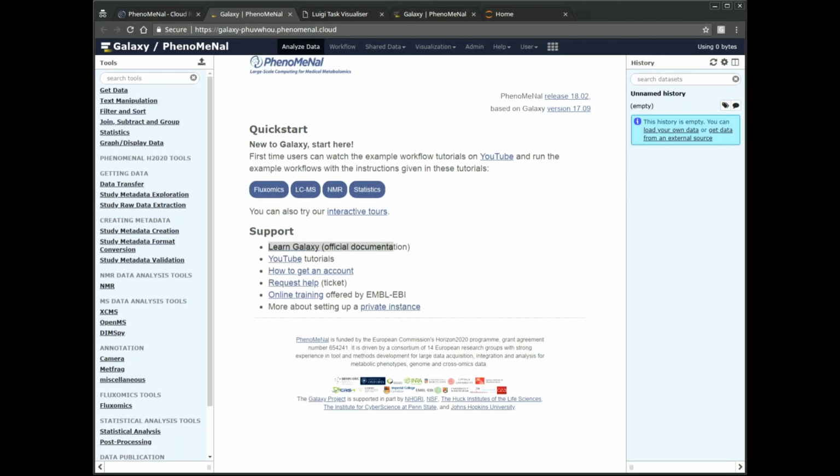That way, any data that goes onto that cloud remains in the cloud. In that case, you still get the benefits from the point of view of managing the computers, the informatics solution, but you don't get the same flexibility, say, as in I can rent 3 machines for an hour and that's it, because that cloud has been set up for that specific use case.